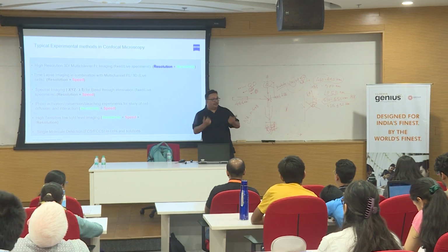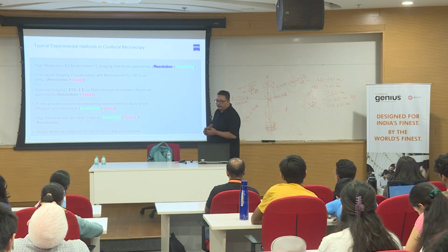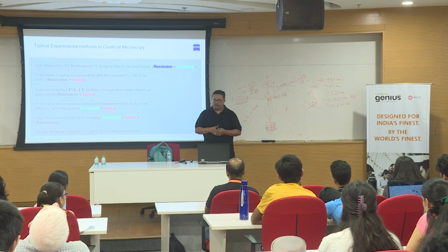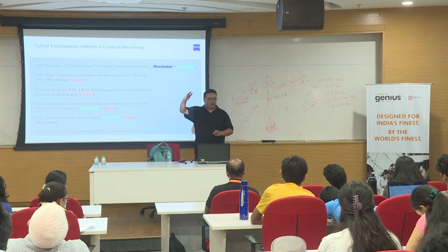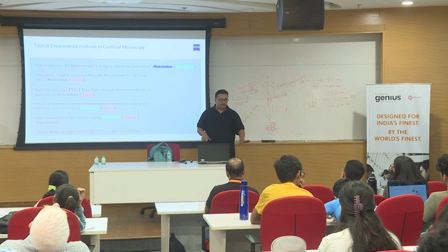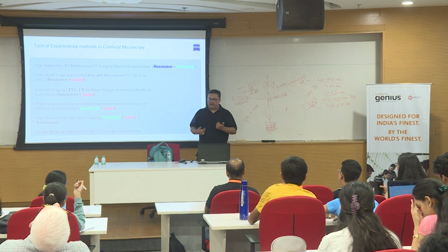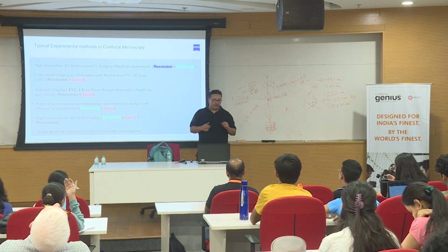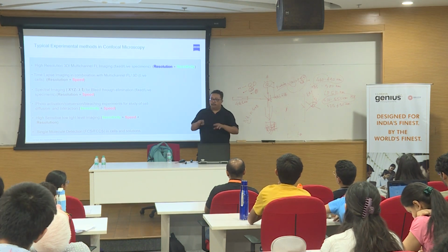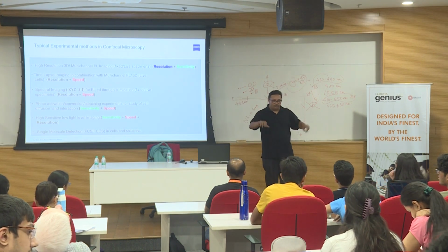Similarly, if you talk about a 10-bit image, how many grayscale values? 2 to the power 10. How much is 2 to the power 10? 1024. So on a scale of 0 to 1023, whatever is 1023 is brightest and whatever is 0 is darkest. Suppose on this scale my intensity value or grayscale value is 550 and your grayscale value is 600, you are whiter than me. Simple as that. That is how you do a comparison, and that is how you quantify intensities between two different positions.